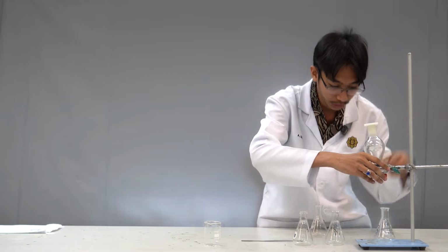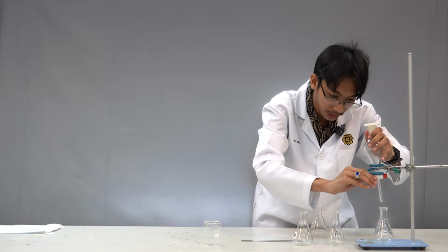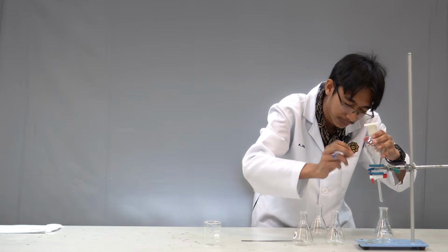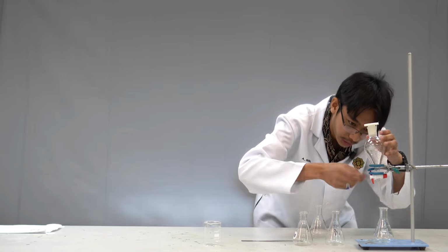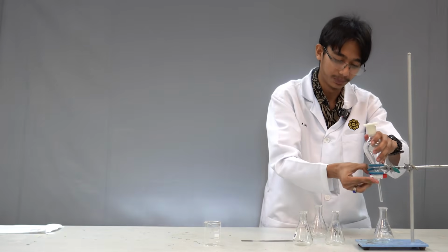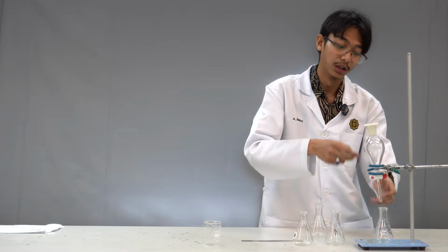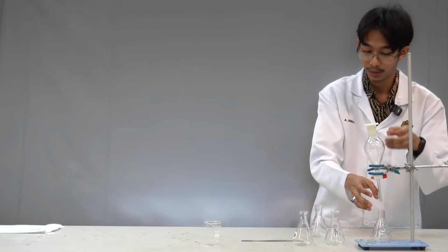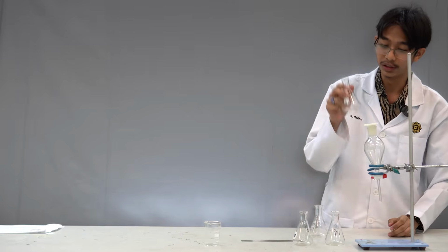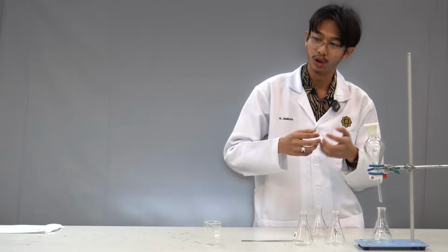What you're going to do is open the lid slowly, open this funnel slowly, make sure the bottom layer comes out, and when the bottom layer comes out, make sure to close it in time, to make sure that there's no mixing of the acid that we want, because we're trying to get as much acid inside of this flask as possible, because extraction, right? Want to extract, not mix.